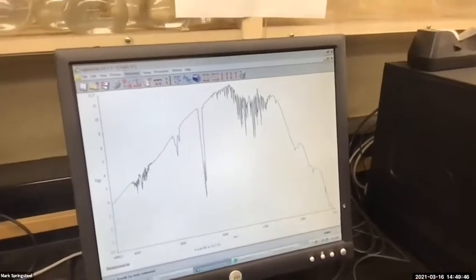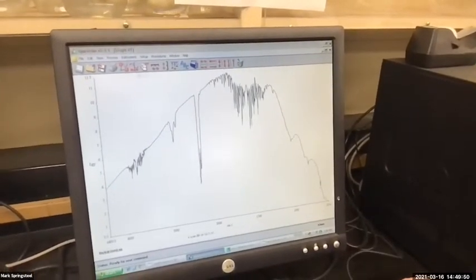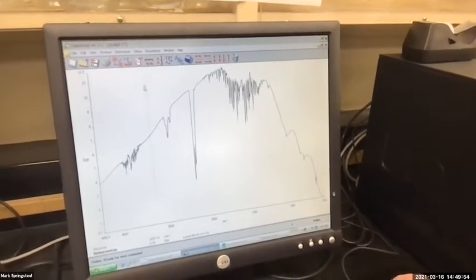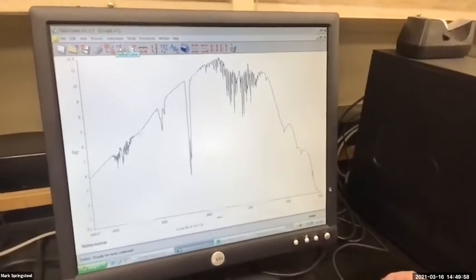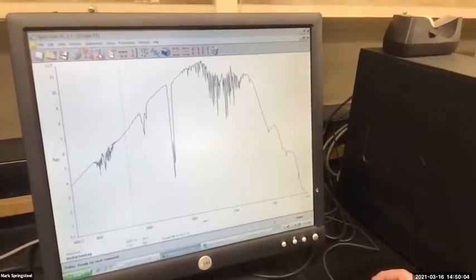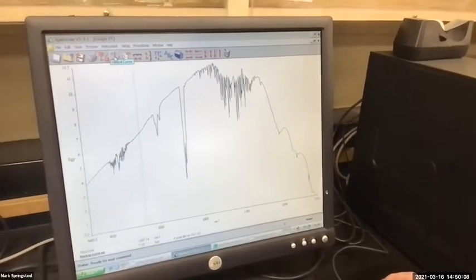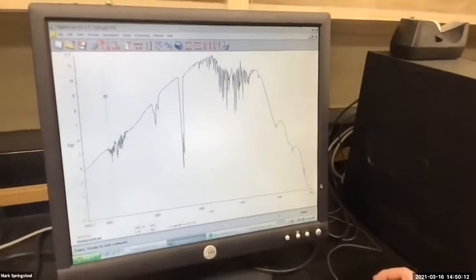So I'm going to go up first and get this vertical cursor, which is this guy. If I click on that, it turns on, see the green line here? I can turn it on and then turn it off, and on again and off again. John, what should I do? Leave it on. Good. Yes, there we go.